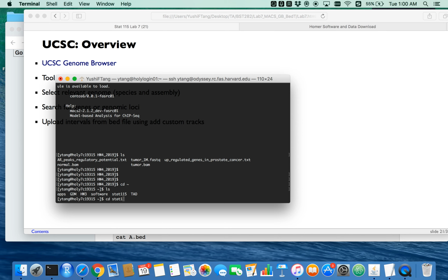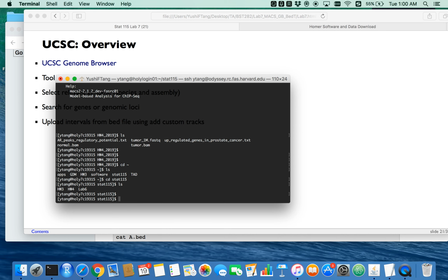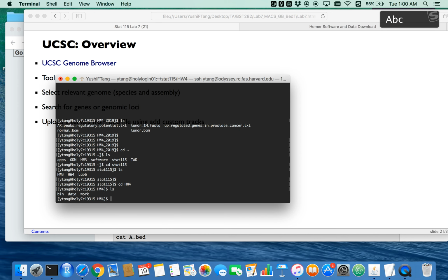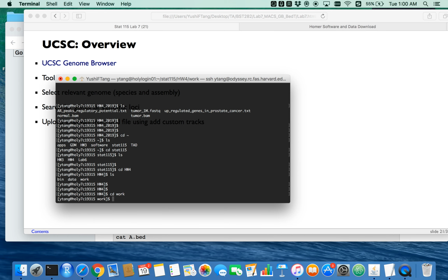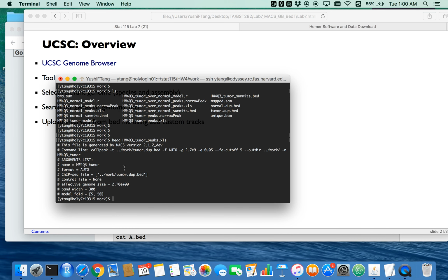So I have already completed all these 4 steps and got the bed files of the peaks of our data. I just want to show you guys how this data looks. Alright, so this bed file is actually the peaks file. Oh, this is the peaks file. So if you go to the peaks Excel file, you can see all the details about the threshold that you are using.